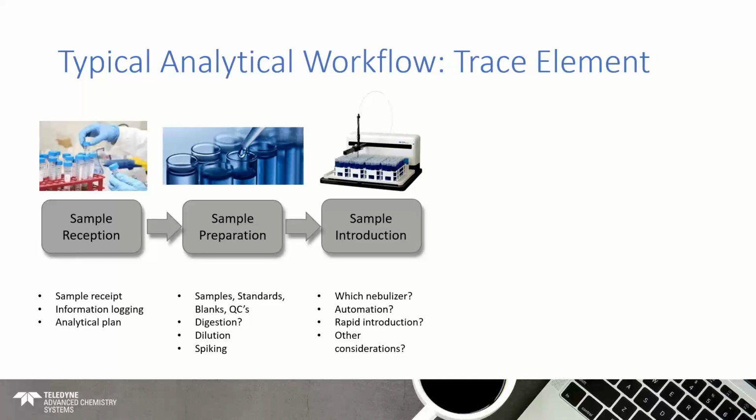When the samples are ready, we then move on to sample introduction. So here, samples are taken to some sort of process which delivers them into our ICP instrument. That will either be an ICP optical system or an ICP mass spec. Now, what we're focusing on in this workflow is liquid samples. There are other workflows where we can look at solid samples, but we're looking at liquids in this case.